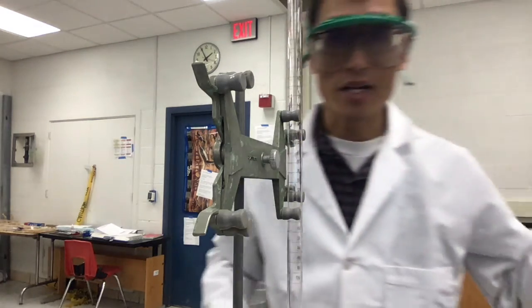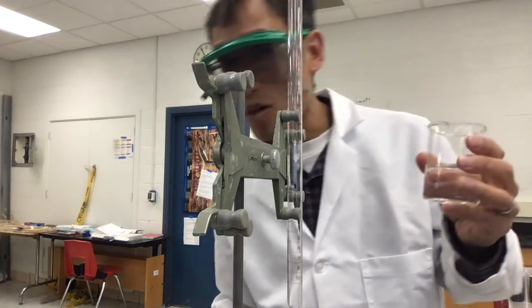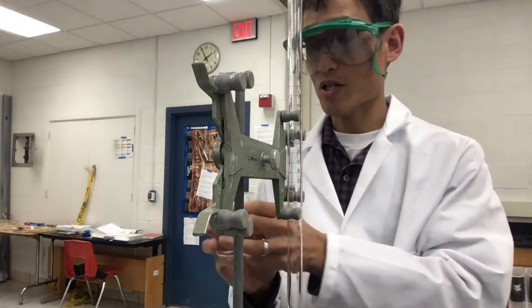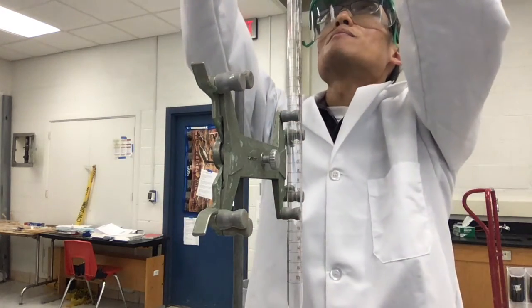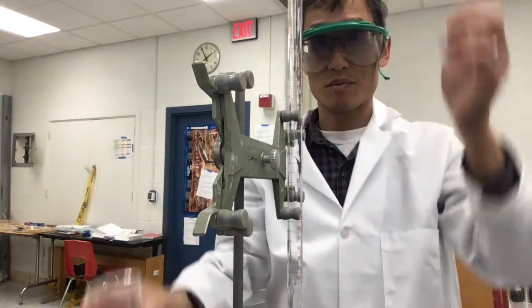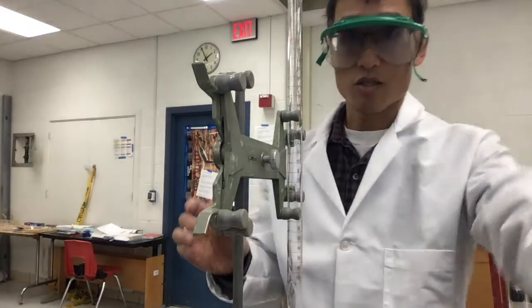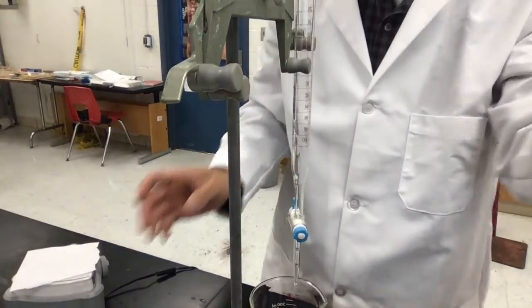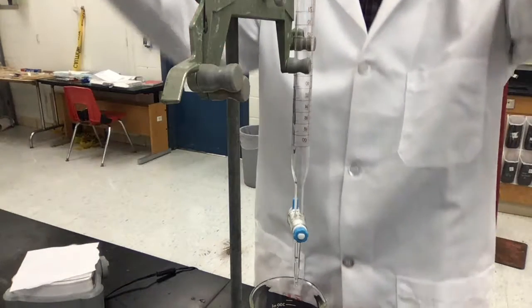So this is 0.100 molar sodium hydroxide, NaOH. I'm just going to pour a little bit in here. Okay, so just let that run through. Do that once, do it again.